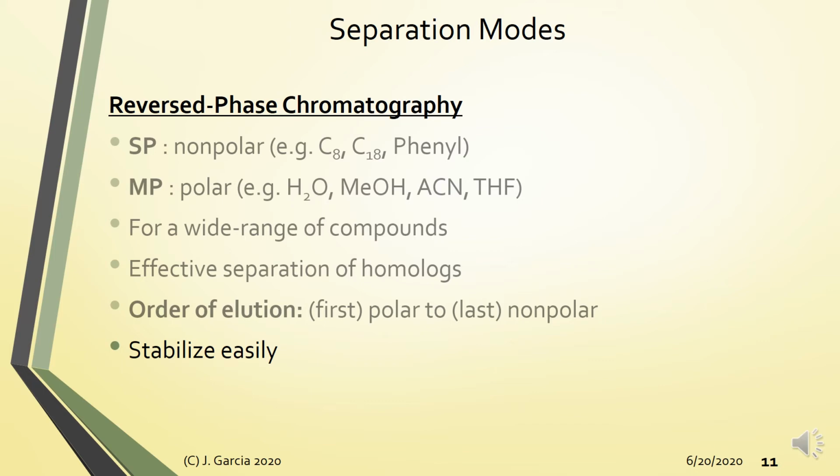Again for several minutes at a higher flow rate. At this time, you can maybe already reach the analytical flow rate. Then you pump in the mobile phase for several minutes also. Some package inserts will tell you to pump in at least 33 column volumes worth of mobile phase before you start the analysis. This conditions the column with respect to your mobile phase and stabilizes the baseline for the chromatographic run.